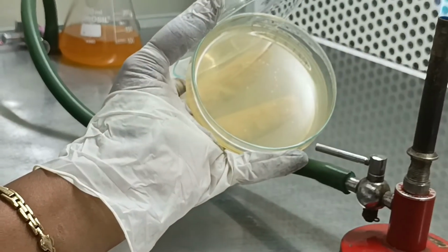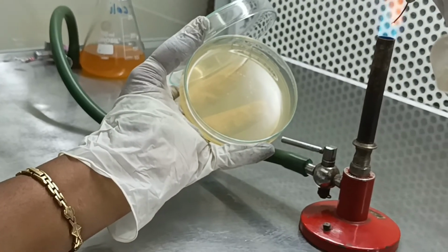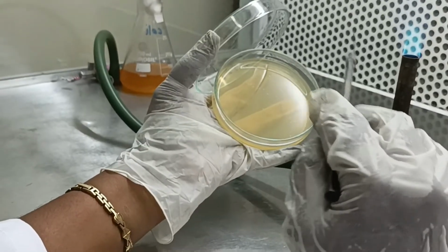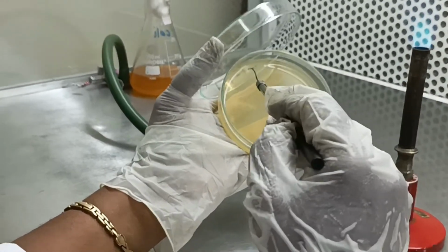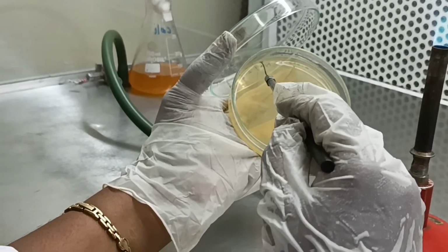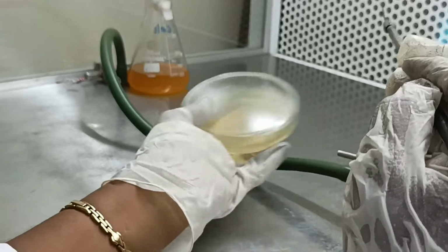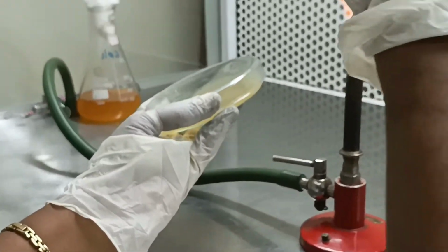Reflame and cool the loop and turn the petri plate 90 degrees. Touch the loop to a corner of the culture in area 1 and streak the inoculum across the agar in area 2. Follow the same procedure on the 4 corners.